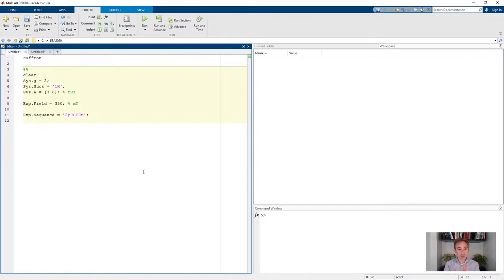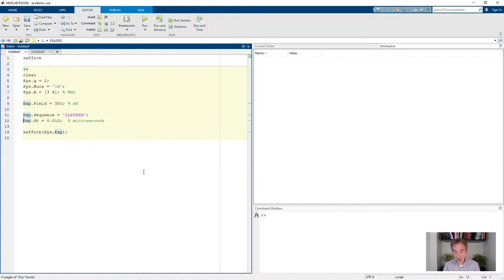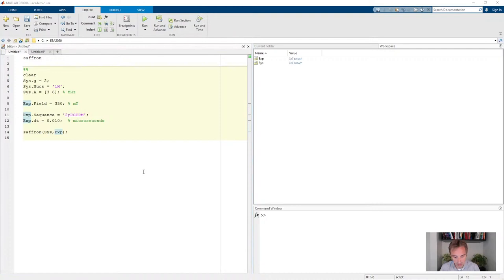In this experiment the tau value is incremented in small time steps and the echo keeps decaying, so we have to specify the time increments. DT is used for that — we'll take a value of 10 nanoseconds, but the units required for EasySpin are microseconds, so it will be 0.01 microseconds for the increment. Then we just call SAFFRON with the information about the spin system and the experiment.